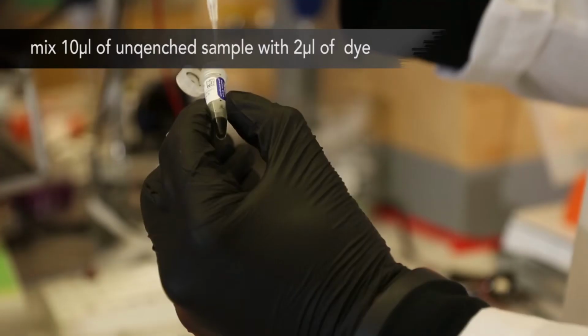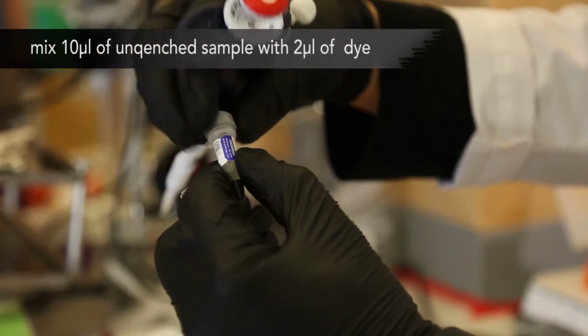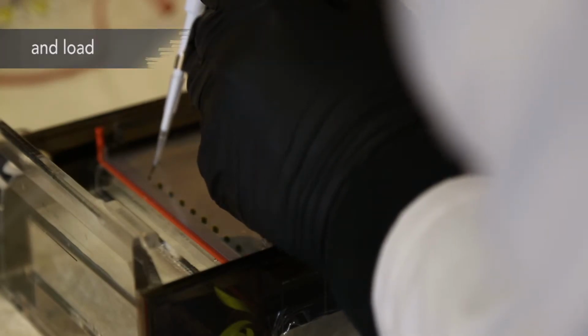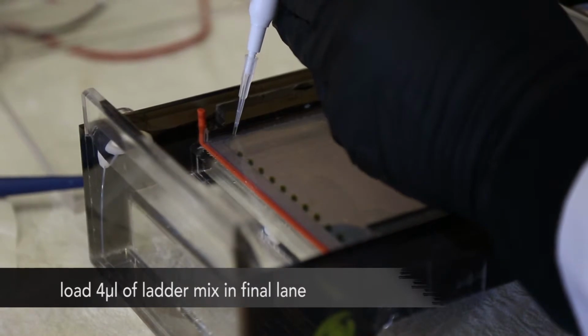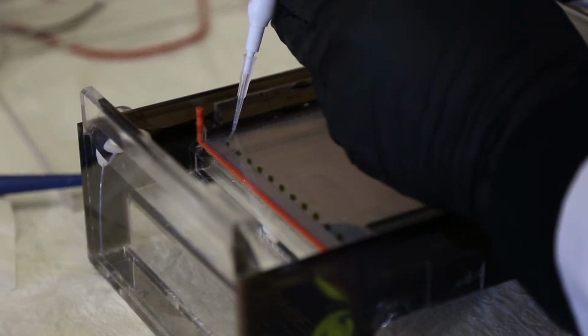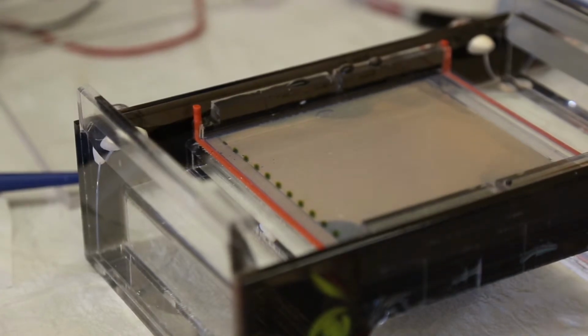Additionally, 10 microliters of the unquenched sample can be mixed with 2 microliters of 6x Ficoll loading dye, and these 12 microliters can also be loaded. In the final lane, load 4 microliters of the ladder mix. Having a ladder on both sides helps if there is skew at the running or imaging stages.